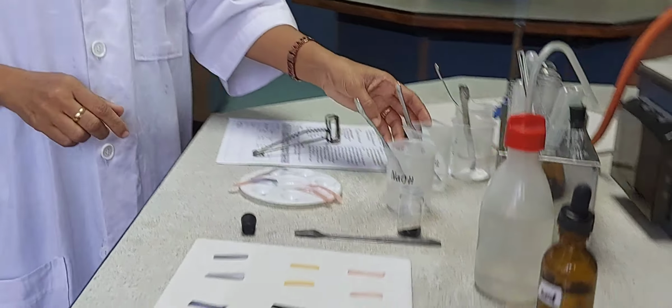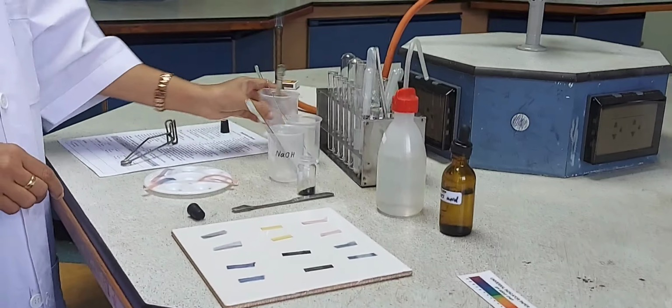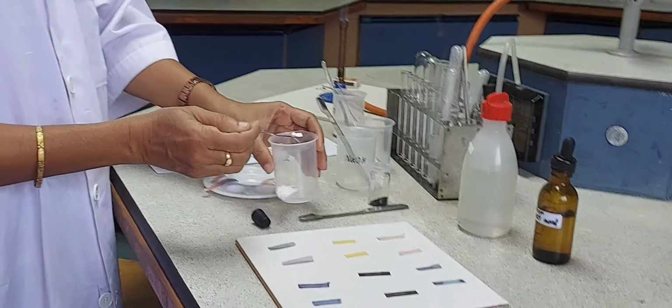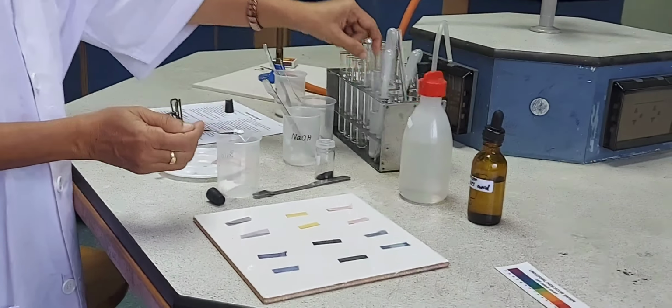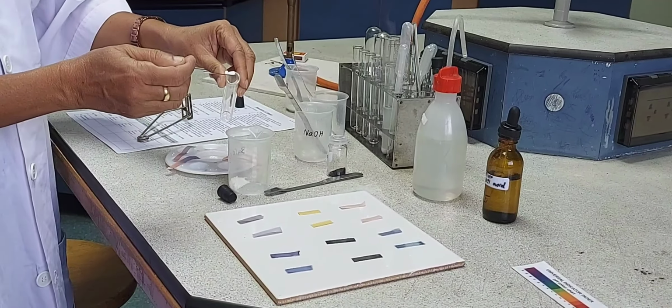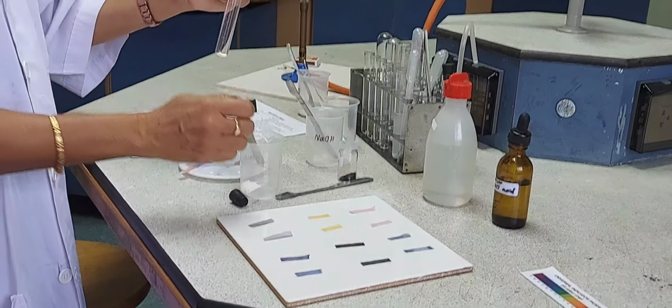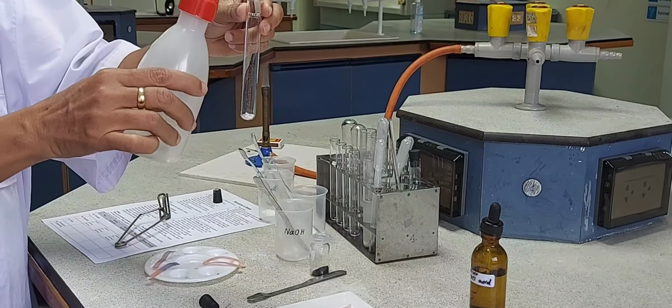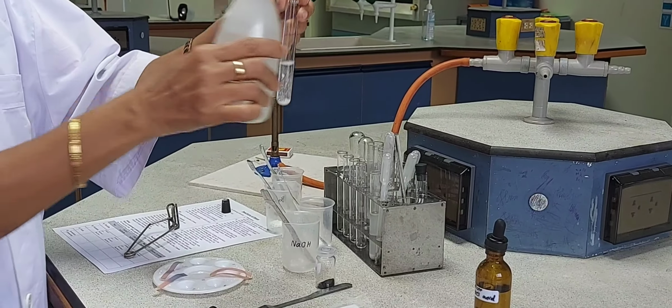The next base of our study is barium hydroxide. So I'm going to take barium hydroxide in a test tube and try to dissolve it in water and see whether it is soluble, completely soluble, or less soluble.